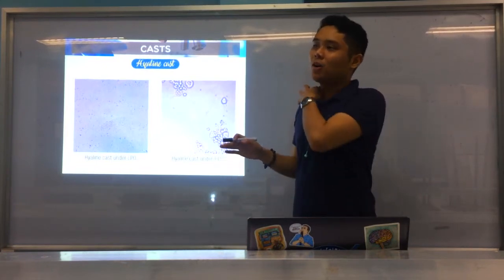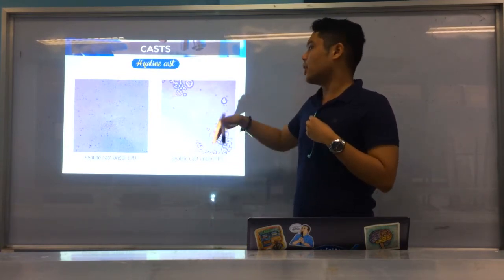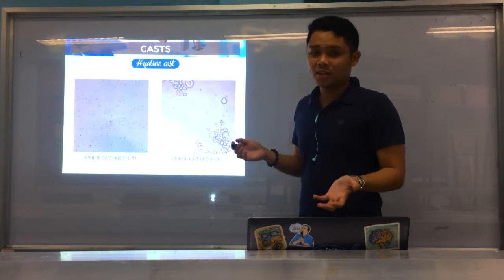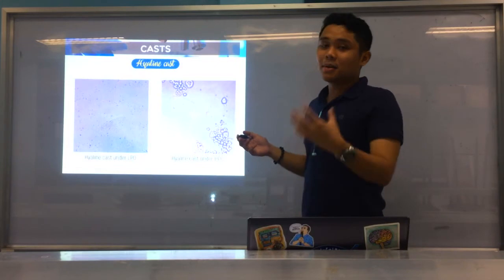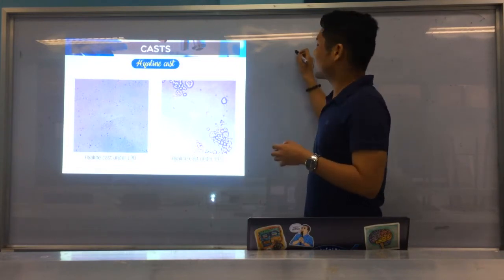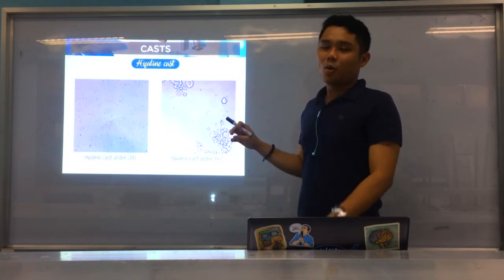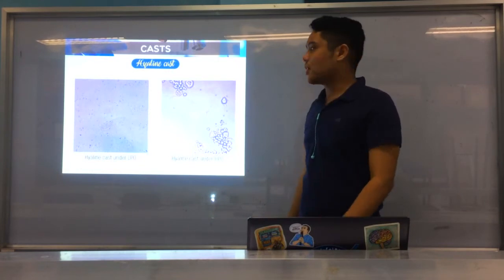Alright, for the hyaline cast, you may see one RTE or other cells appear inside, but that's not quite significant because it's only one. There aren't many. Of course, that could be part of the normal processes of the body. If there are RTEs, it's because of where the uromodulin comes from, right? The uromodulin or the cast initially attaches to the RTEs. So upon disintegration or removal, the RTEs appear, so that's still quite normal, okay? Usually one or two RTEs inside a hyaline cast.